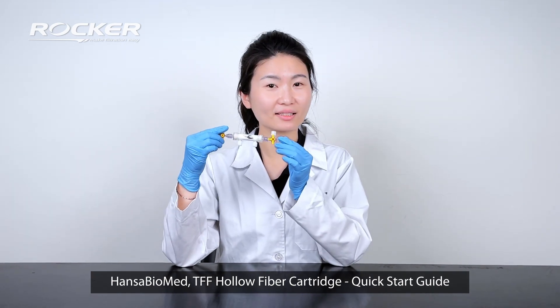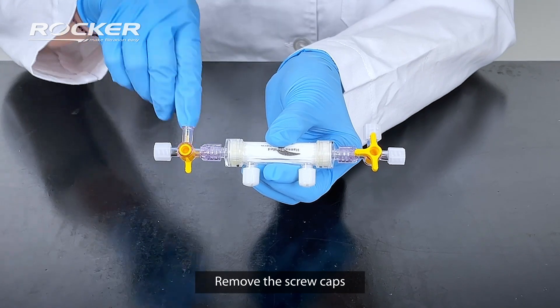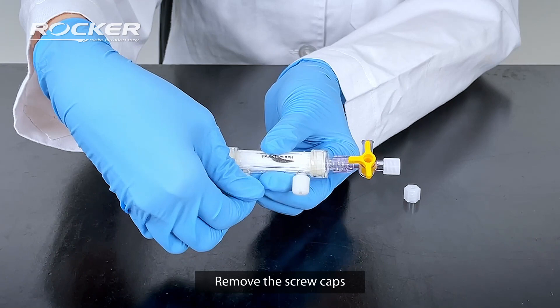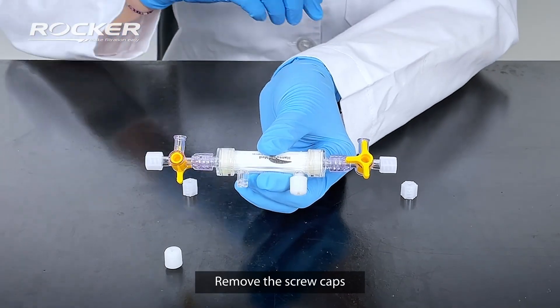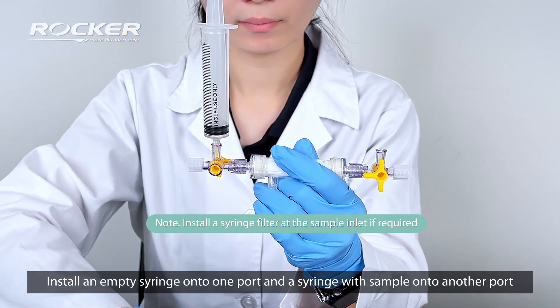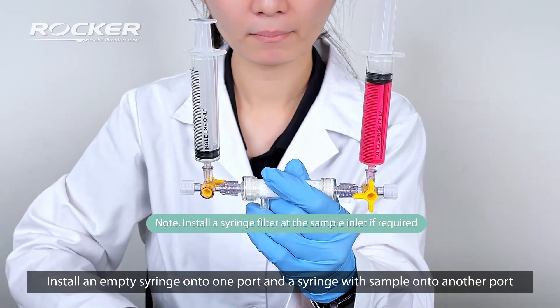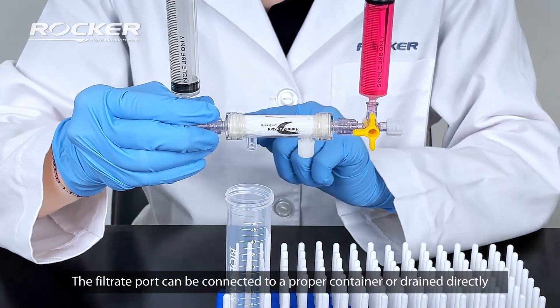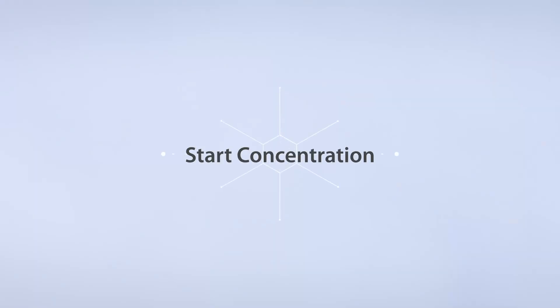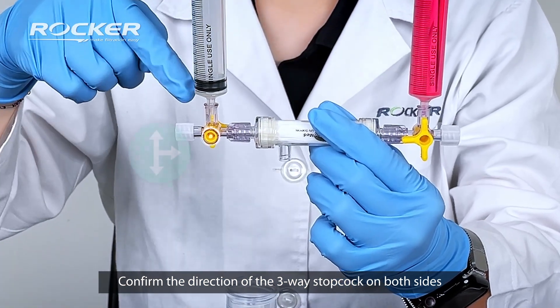Handsa Biomed TFF hollow fiber cartridge quick start guide. Remove the screw caps. Install an empty syringe onto one port and a syringe with sample onto another port. The filtrate port can be connected to a proper container or drain directly. Confirm the direction of the three-way stopcock on both sides.